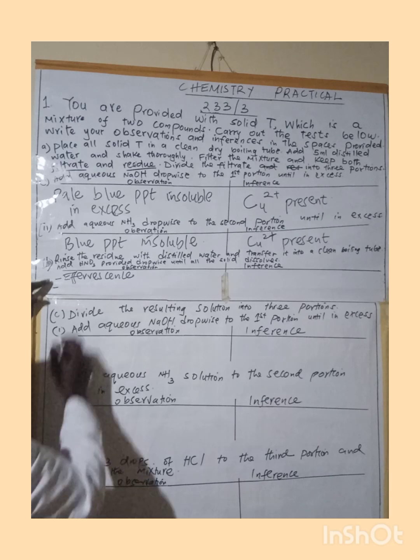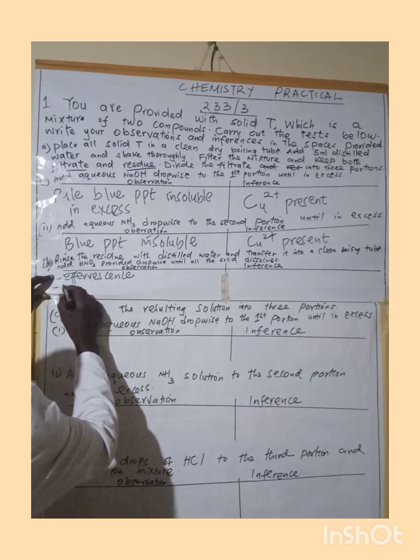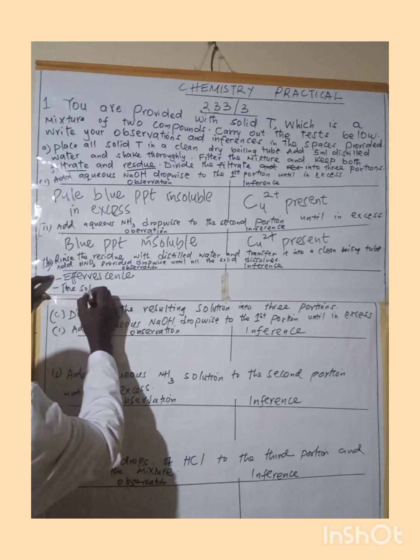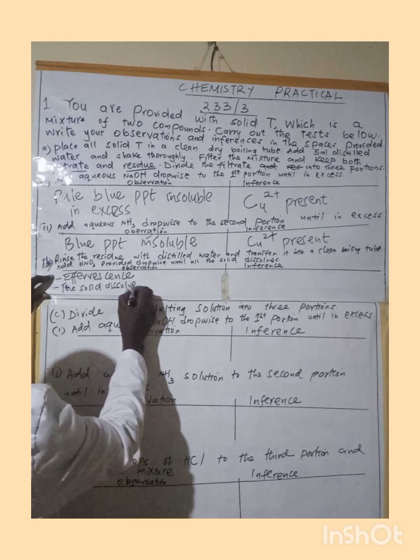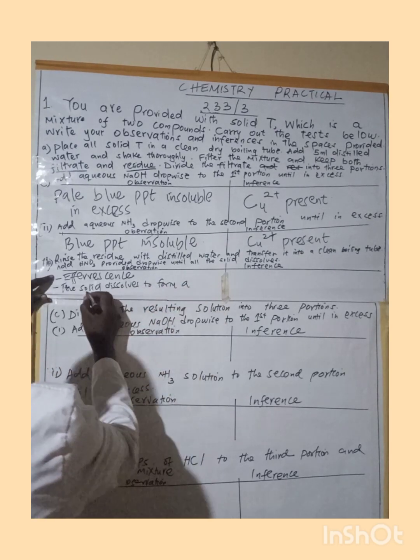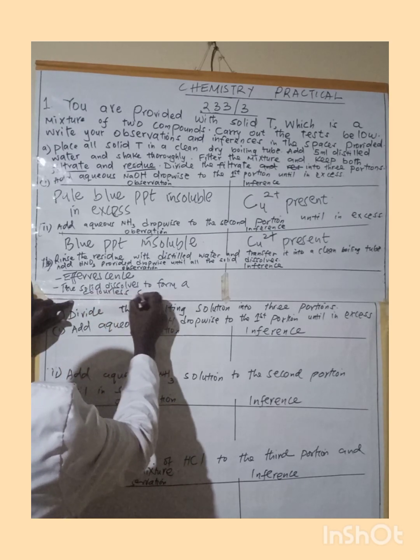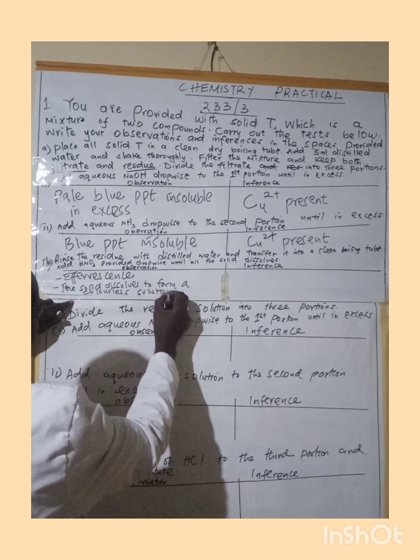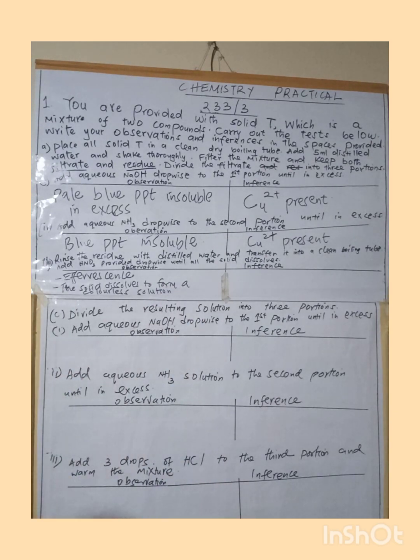Then number 2, the solid dissolves to form a colorless solution. So that is what was seen under the observation.